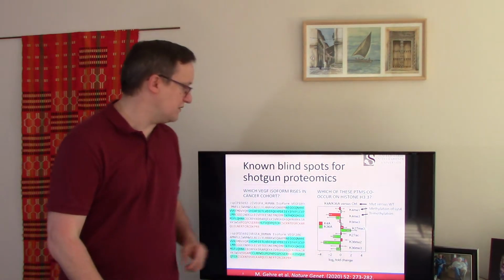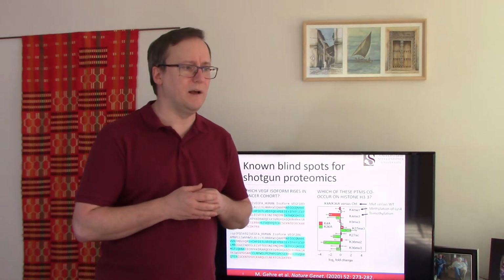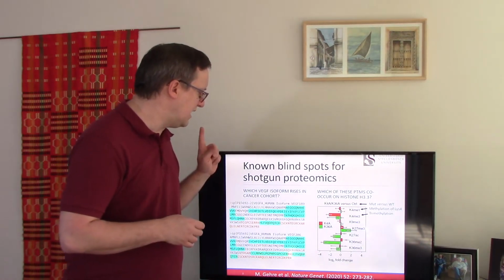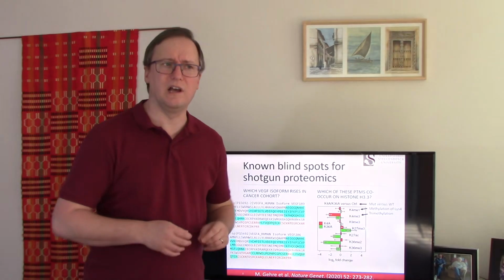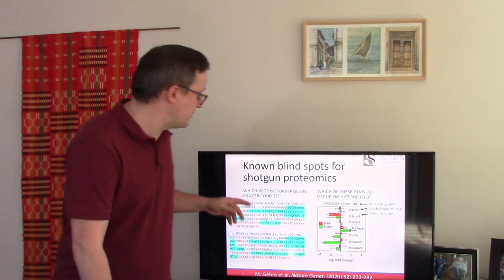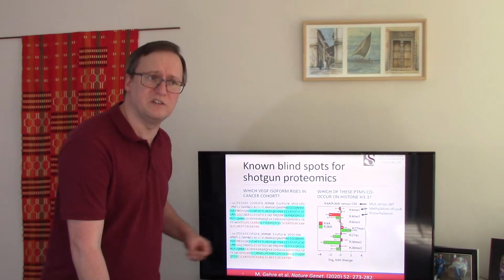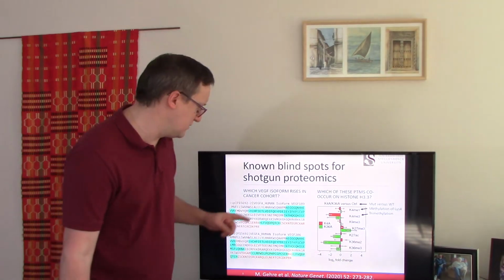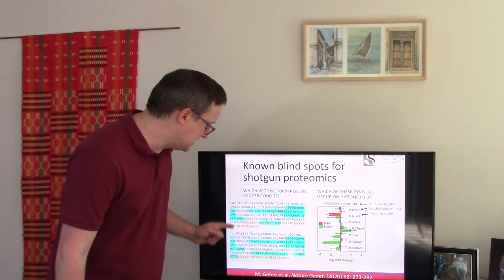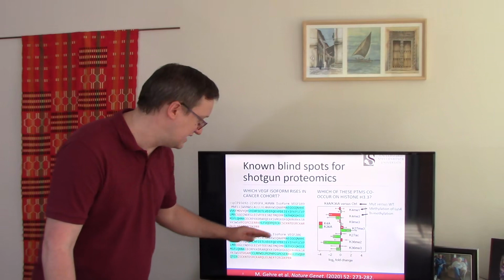Let's start with a gene called VEGF. VEGF is interesting to people who work in cancer particularly. If I remember the name correctly, it's vascular endothelial growth factor. So here we have two different sequences that have been posted to UniProt for this gene. We see that the isoform VEGF 189 has this sequence, and the sequence for VEGF 206 is slightly different.